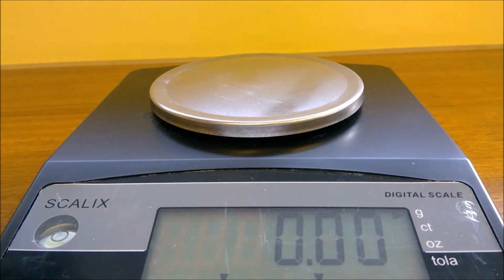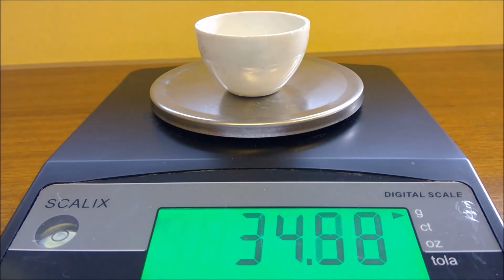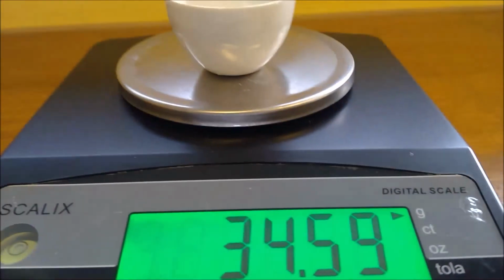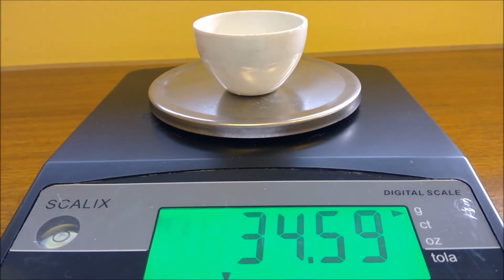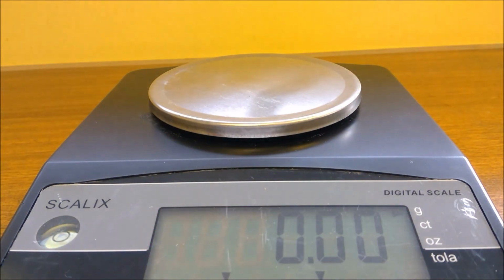And then with 2 hands, I can put our crucible down on the balance there. Okay, so please record the final mass on your results table. So have a final peek in there, and you can then use your values to work out what mass of hydrated copper sulfate we had in the first place and what mass we have remaining at the end.